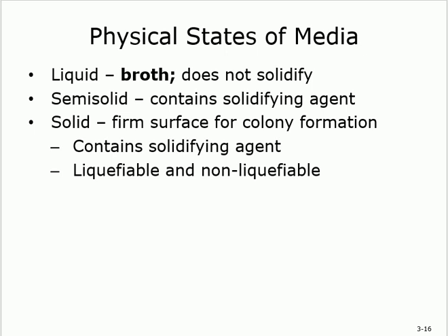Solid can be liquefiable or not. We have different types. Okay? This is liquid and that's it. You cannot solidify. This is semi-solid, you can. This is solid, it's already solid, it's firm. But you can liquefy or not. We have different types.